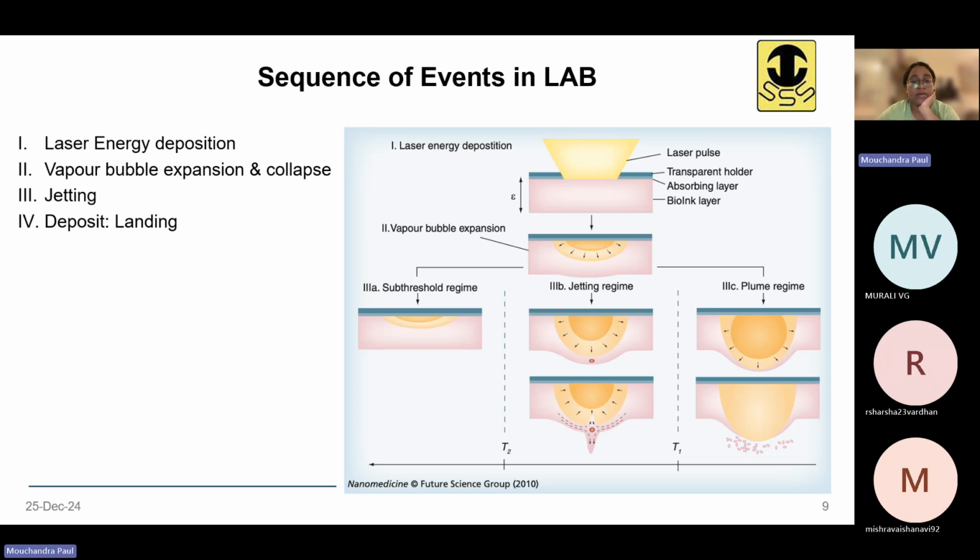Whereas in order to get good resolution in your printing process, you want single droplets to be formed every time. You can modulate other parameters that we have discussed in the paper as well, like the scanning speed, to make sure that droplets are deposited individually containing single or more cells, or the droplets can be spaced very close to each other.